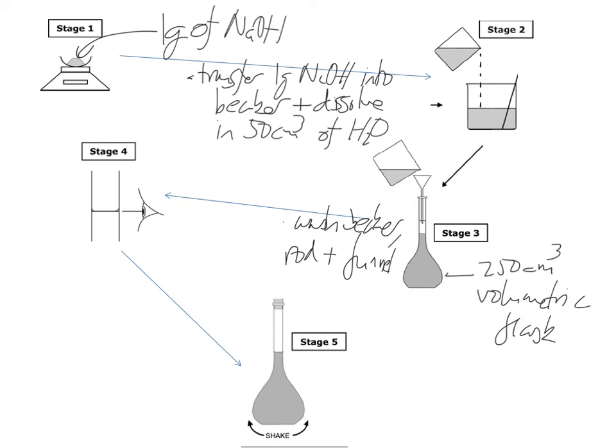If we've got too much in there, we've got a problem. We have to start again. So what we're going to do is to get the liquid from that level up to the line, we're going to use a dropping pipette or a pasta pipette.